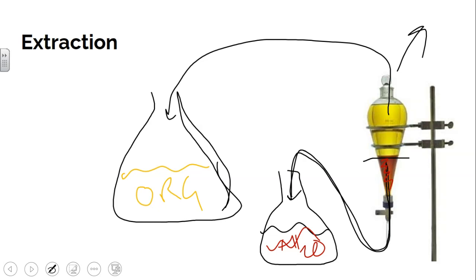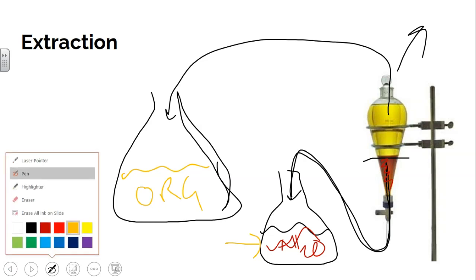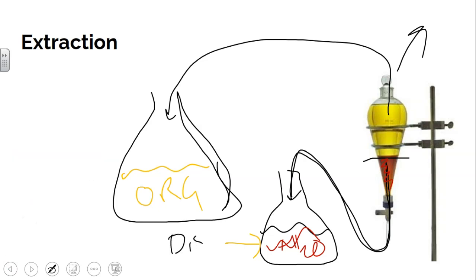Now for this particular lab, Lab 9, the water layer, you're going to just dispose of this. Okay, this has junk in it. What does it have in it? Well, it has acetic acid salts, sodium hypochlorite. It's got things that you don't want.